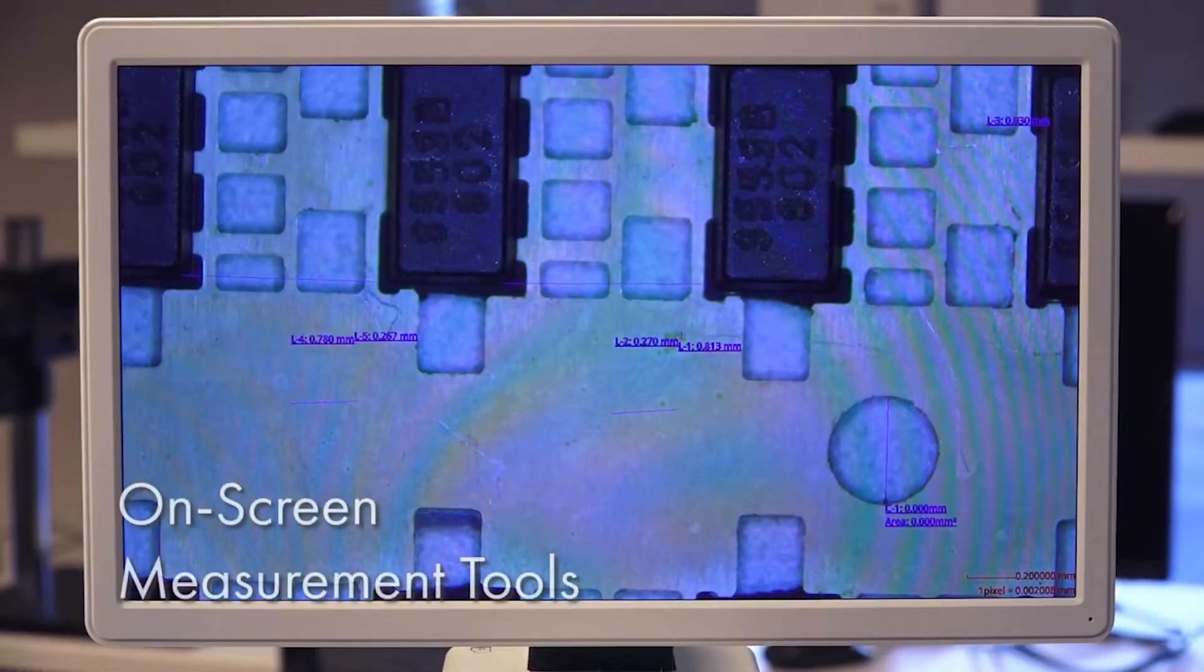The MicroView also features on-screen measurement tools, giving operators the ability to take accurate measurements.